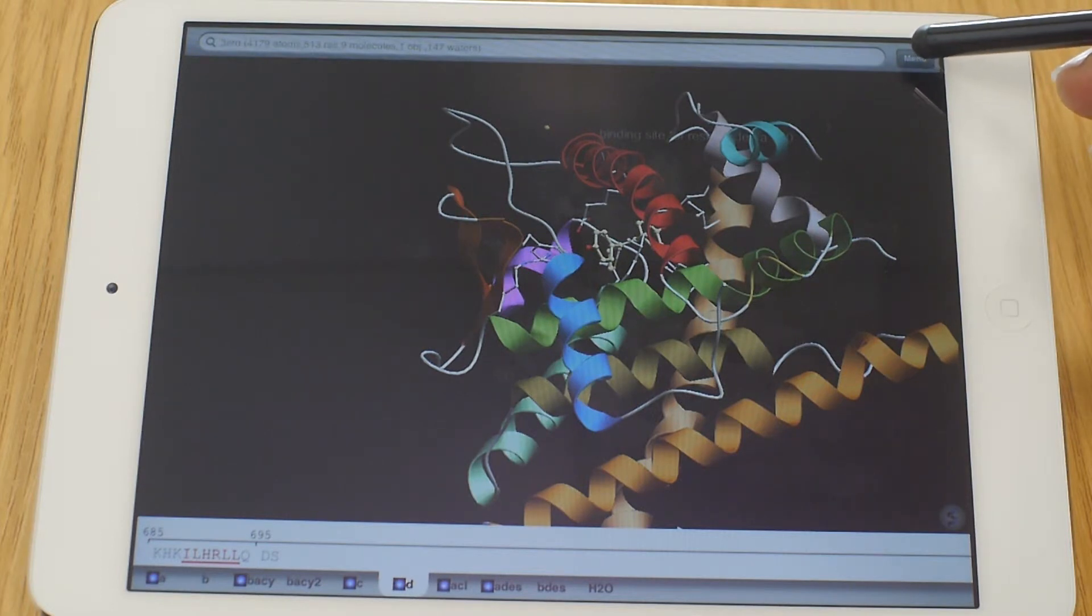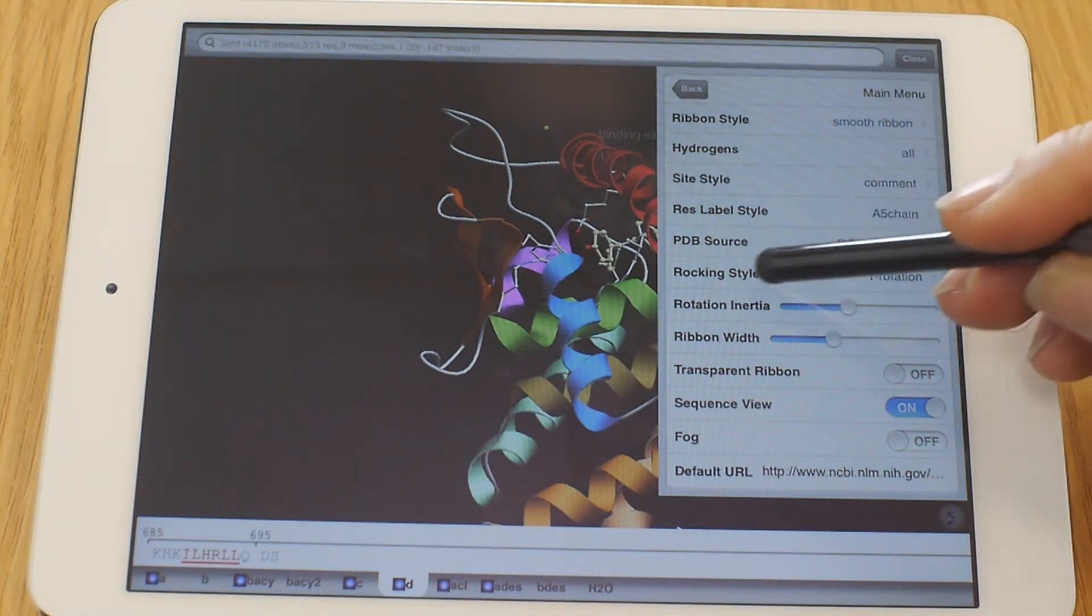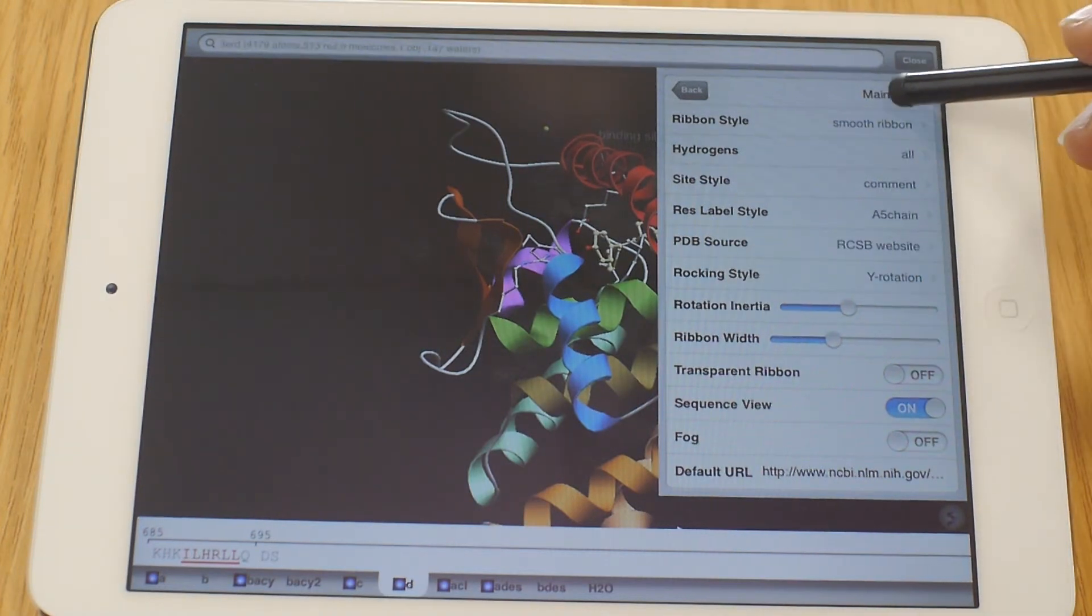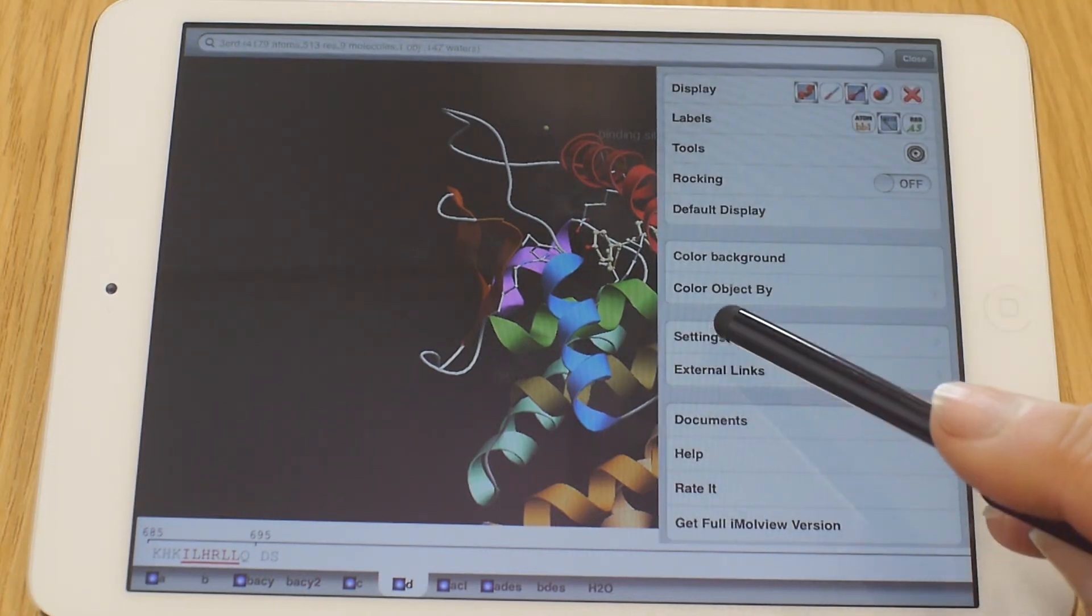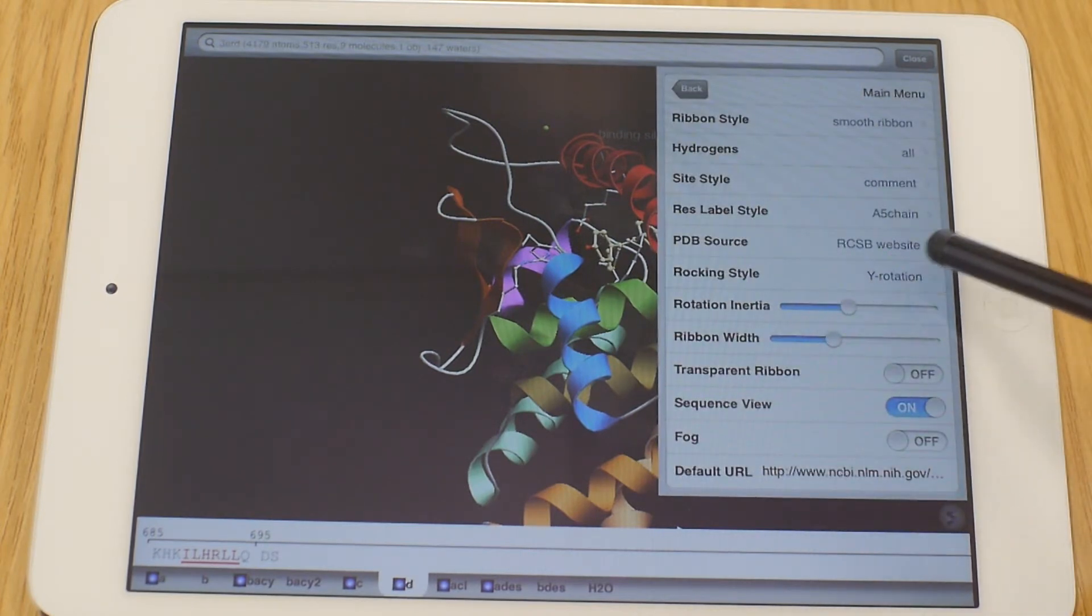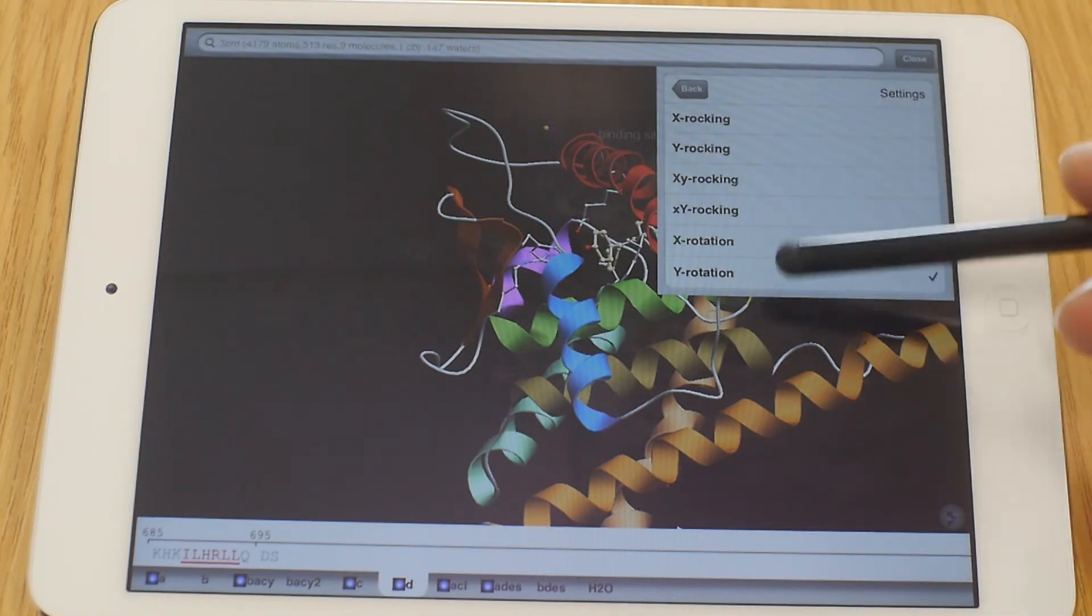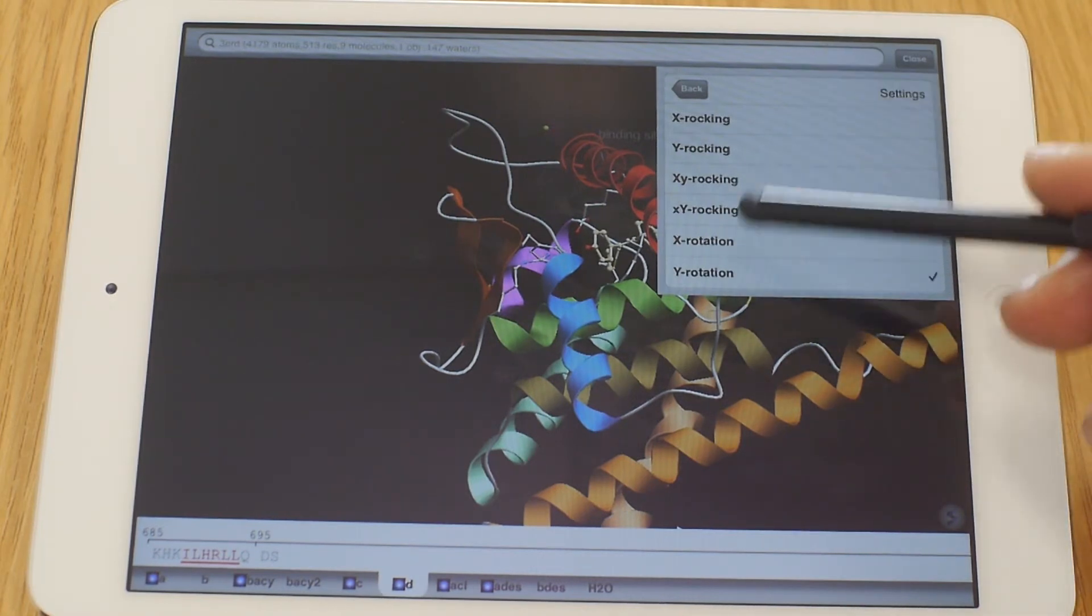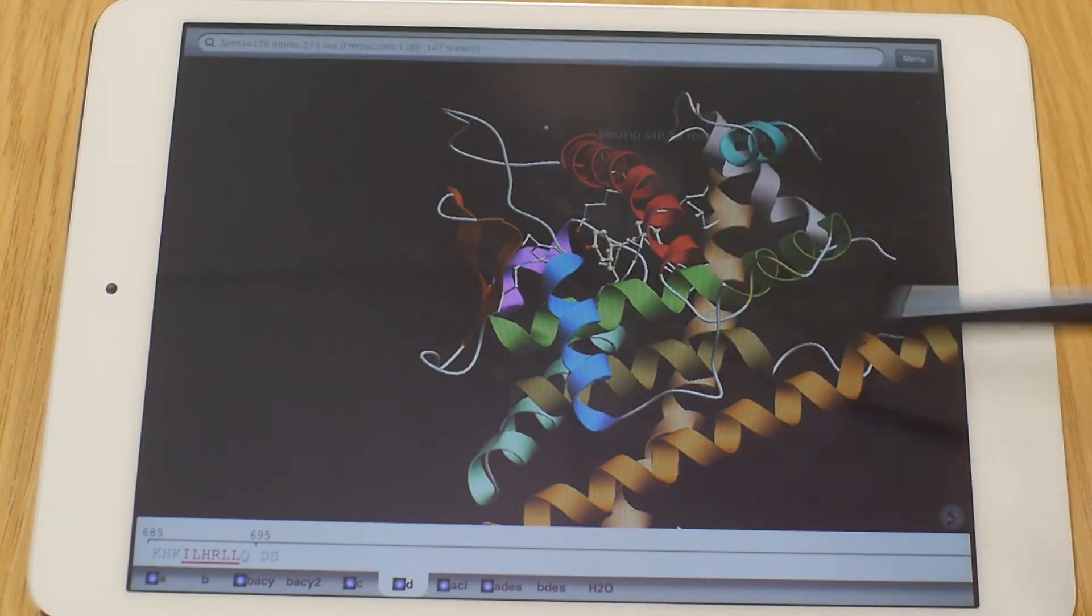There's another thing I want to show you. If you go to menu, you can have a rocking style. And this is not the main menu, but this is the main menu. If you go from the main menu back in settings, then you can have different rocking styles. I chose here Y rotation. It can be different ones, X rotation. It can be X, Y rocking, or just Y rocking. Let's press Y rocking. Yes, set to Y rocking.